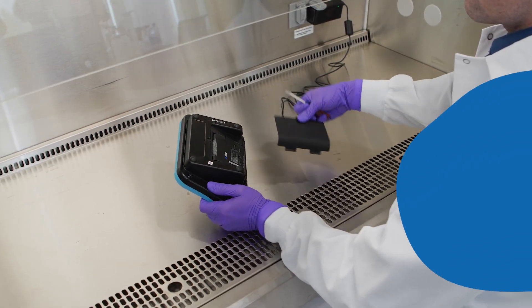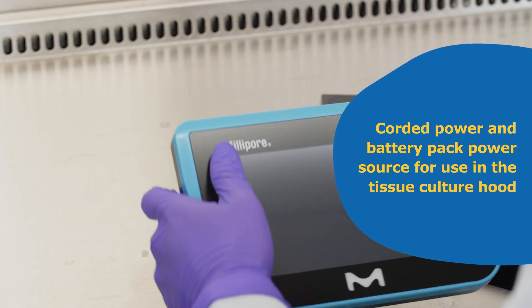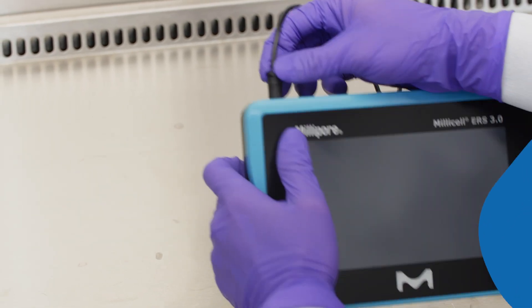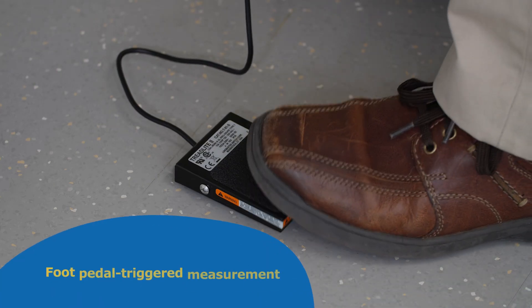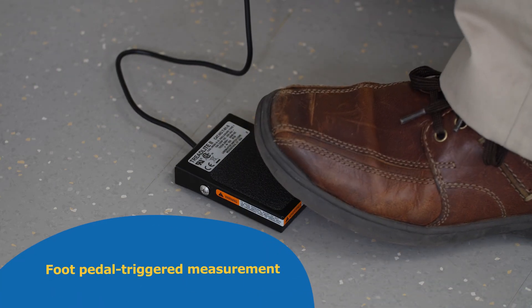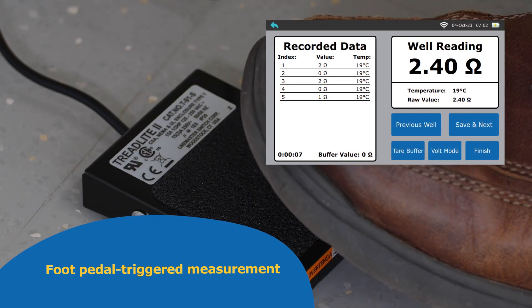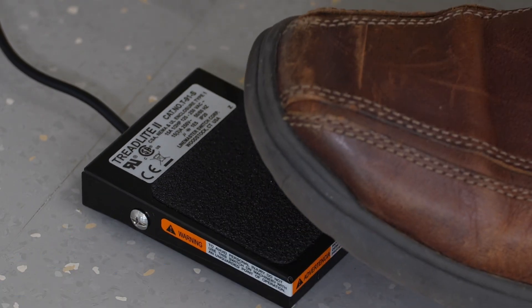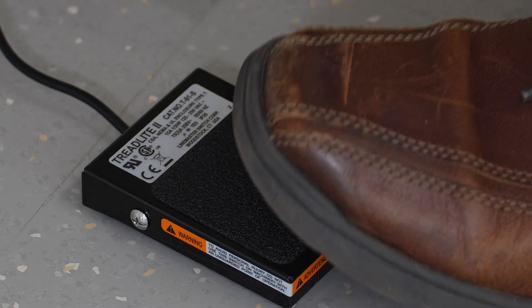Corded power and battery pack power sources enable use in the tissue culture hood. The foot pedal, available with the Millicell ERS 3.0, enables hands-free data capture. There is no need to touch the screen when using the foot pedal, hence minimizing the risks of contamination to your cell culture.